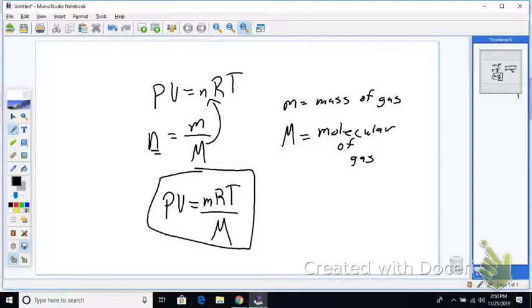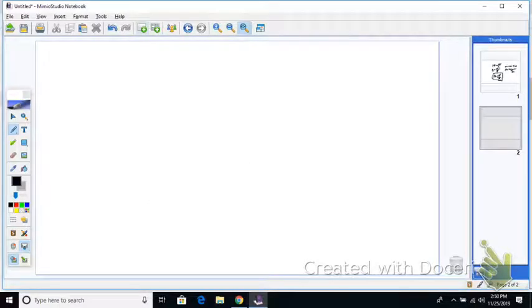So we have to finish filling out this data table. Okay? We're not going to spend a lot of time doing this, but the mass of the empty pipette has to be subtracted all the time because we don't care about its weight other than it's something that holds our substances that we're testing.